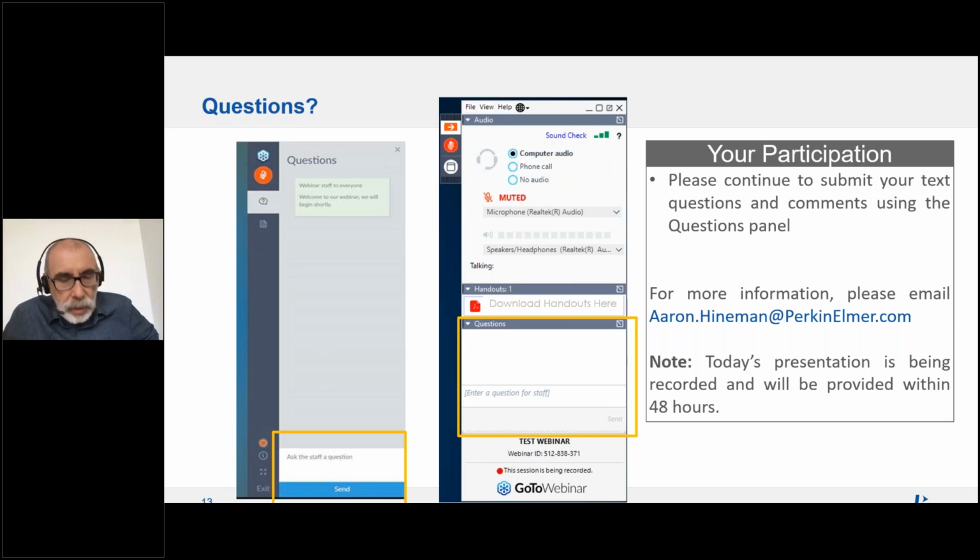Well, the point with the method that we have seen is that it has some clear limitations. Of course, we are getting quantitative results in the range of 1-3 micrometers. In this range, we are getting really quantitative results, both in number concentration and also in size. Of course, in a real sample, we are going to find a kind of continuum size, a broader range of particle sizes.